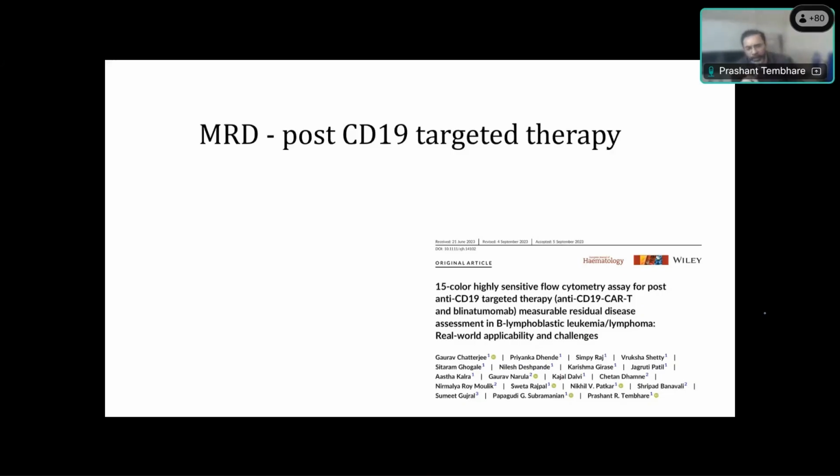So we then look at the other parameter, that is CD34 positive cells out of total mononuclear cells. If there is more than 1%, that indicates representative bone marrow. If less than 1%, that indicates hemodilution. The same way, look at the CD117 positive precursors, because they include myeloid blasts, promyelocytes, and early pronormoblasts. If it is more than 5%, the sample is not hemodiluted. But if less than 5%, the sample is hemodiluted.